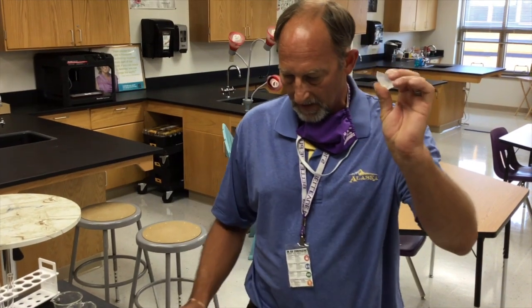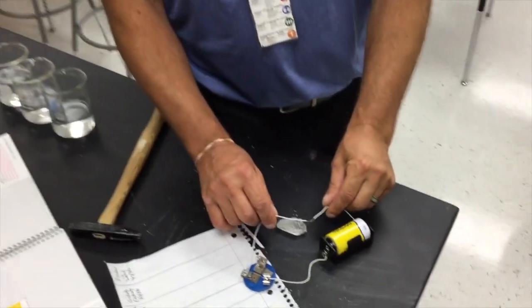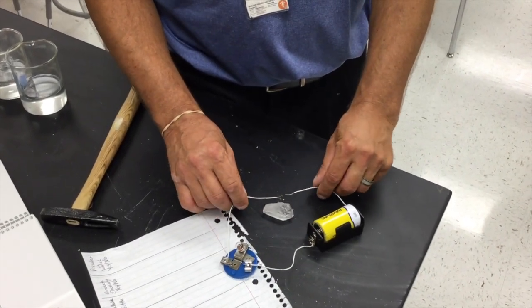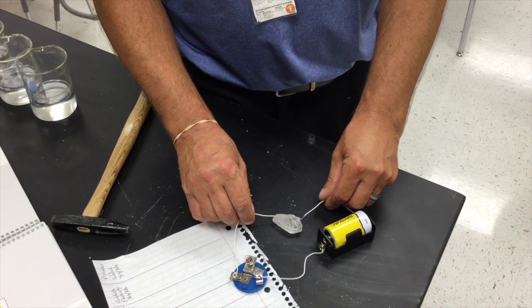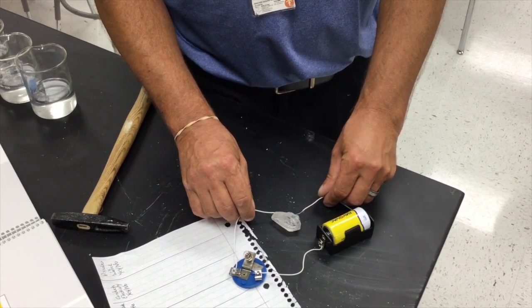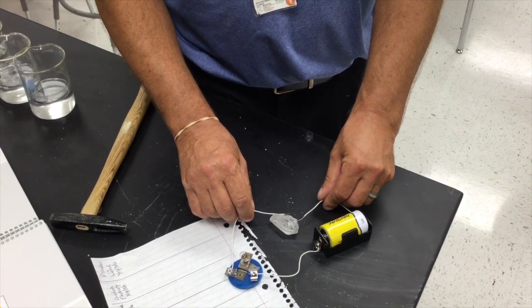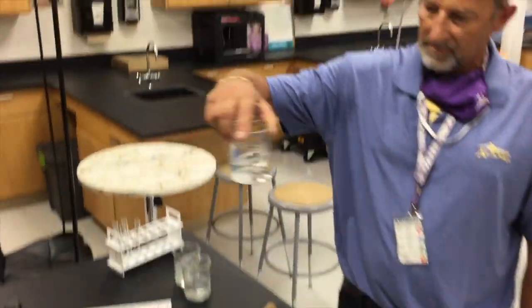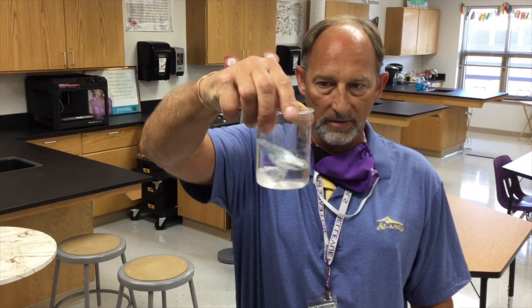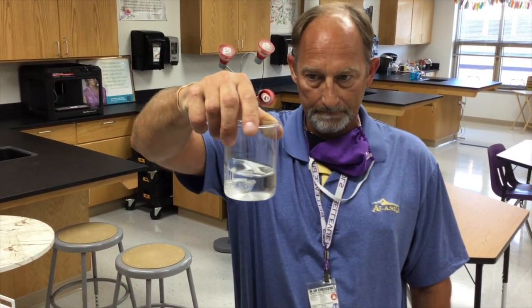Okay. Now, quartz, does it conduct electricity? Again, light means yes, no light means no. And I am seeing no light. So we are not conducting electricity through quartz. And pretty sure we can all realize that quartz is not going to dissolve in water. So there's our second compound. All right, quartz.